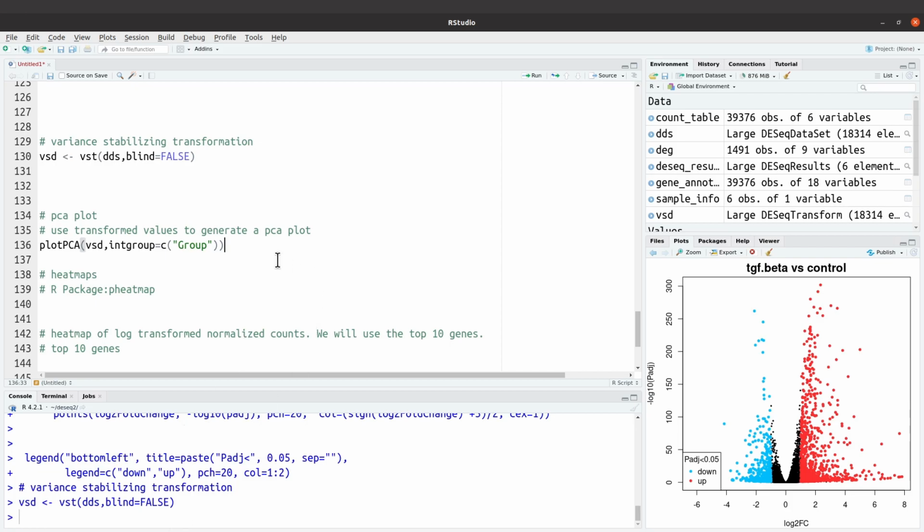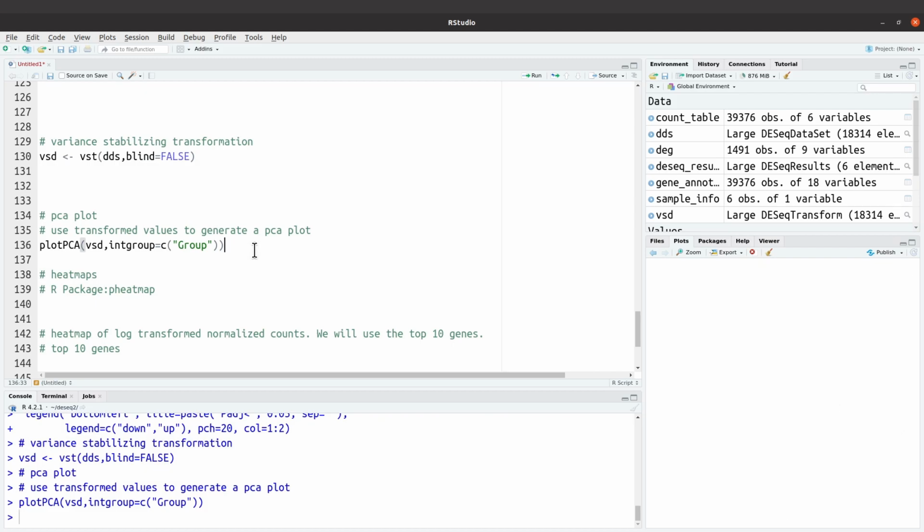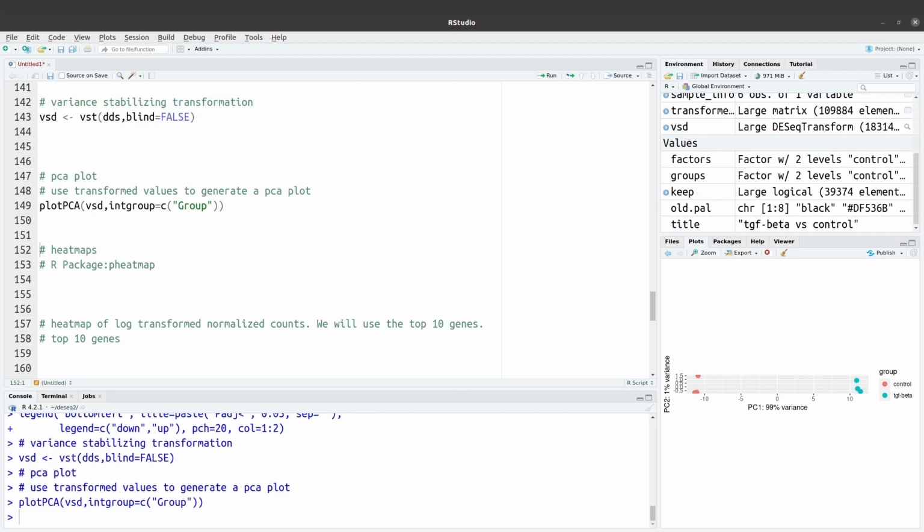So let's do that. So we'll execute it. Then when we execute it, we are going to find our plots generated. All right. Okay, the PCA plot has been generated. So we have it here. This PCA plot looks weird. As a matter of fact, I tried running DESeq2 on a Galaxy platform using the same data I'm using here, and I got a similar figure.